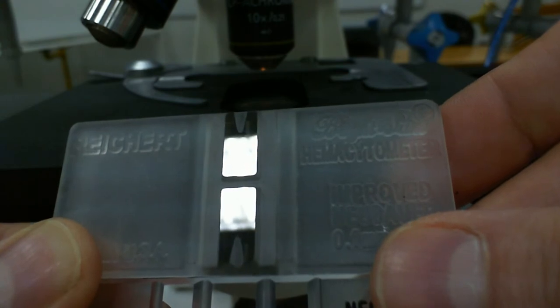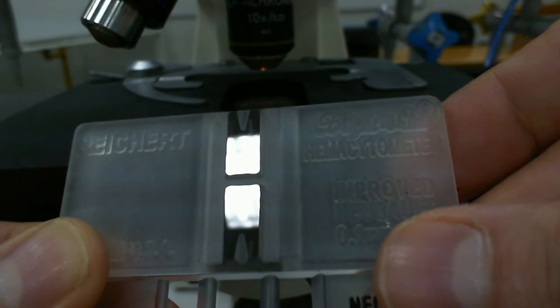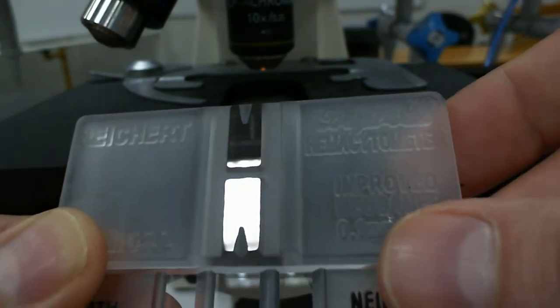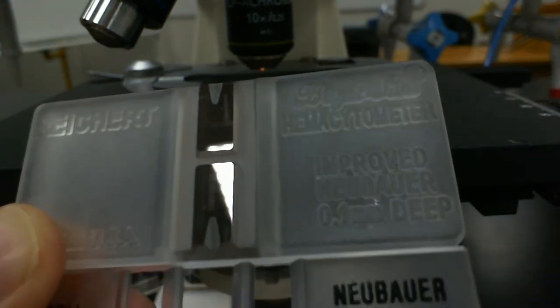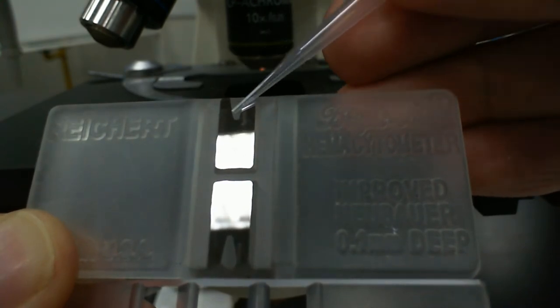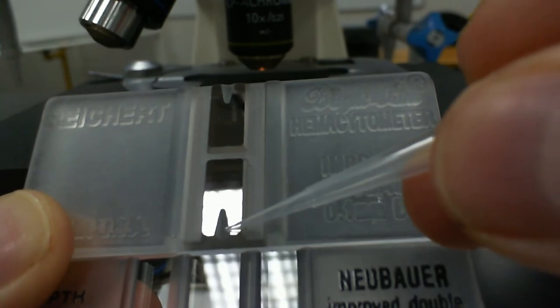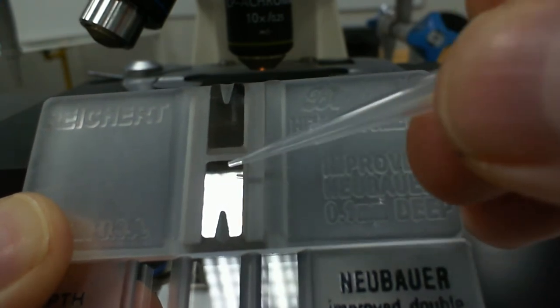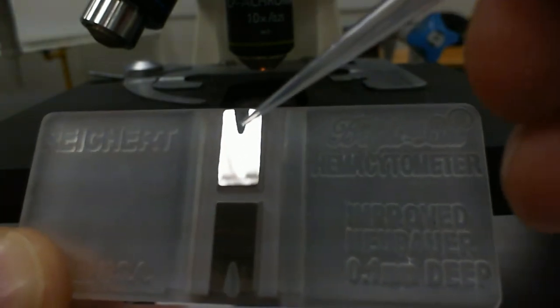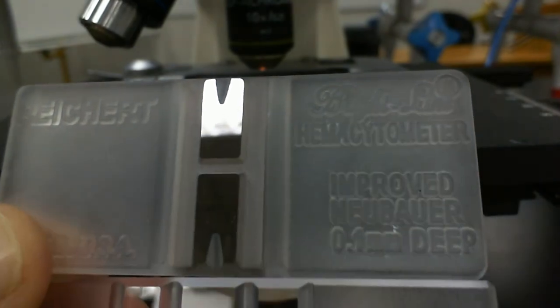They tend to work much better with the heavier, larger, thicker cover slips. The thinner cover slips don't really stick to them very well, and so you might struggle with that one. This also, you can see here, has guides for where to put in your sample. So you'd be putting your drop of liquid in here and in here. And again, that would get sucked up by the cover slip by capillary action. So that's just there to guide your pipette tip so that you know where to add the sample. Okay, so let me just show you what the two of them look like under the microscope.